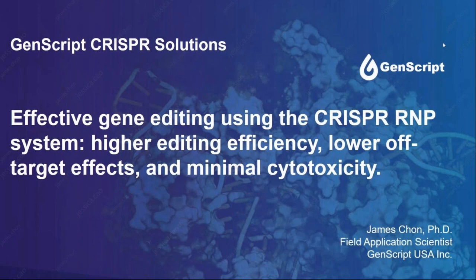In his current work, he supports researchers using CRISPR for functional screening, animal model generation, as well as cell and gene therapies. In today's webinar, Effective Gene Editing Using the CRISPR RNP System, James will discuss why you should use the CRISPR-Cas9 system for your gene editing research and therapeutic purposes, how to choose the appropriate CRISPR and Cas9 delivery method based on your downstream usage, how the CRISPR RNP system of delivery maximizes the CRISPR-mediated editing efficiency, and how you should choose the appropriate grade of sgRNA for your desired application.